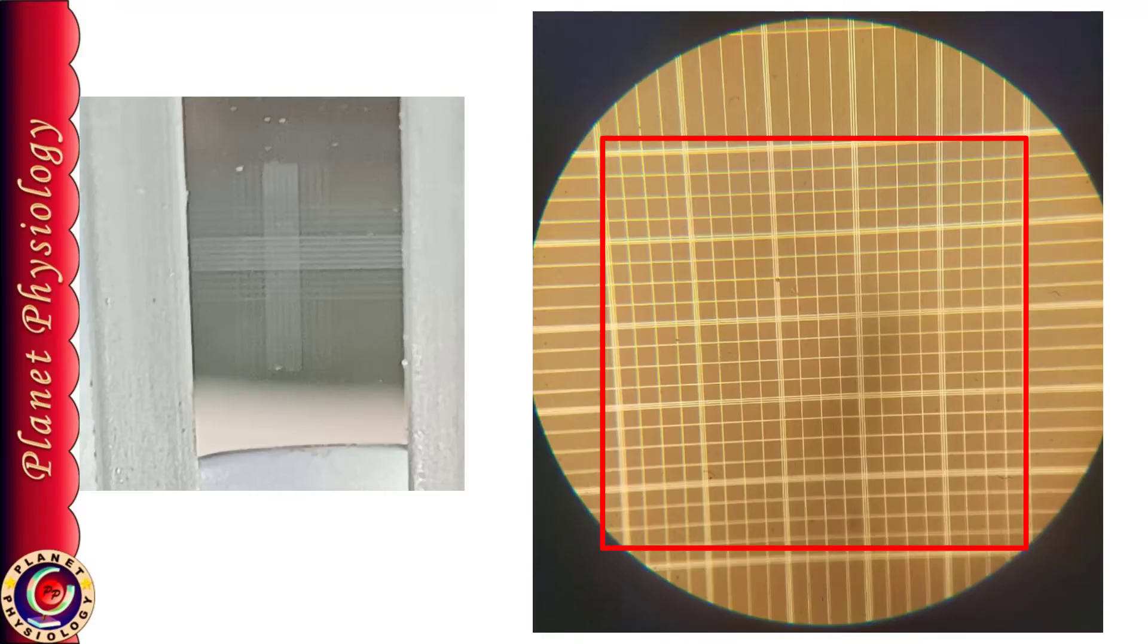Now this part of the square you should focus under high power. Make sure that RBC square should be visible under low power then only switch to the high power. If you are in WBC square under high power, you may not see anything.